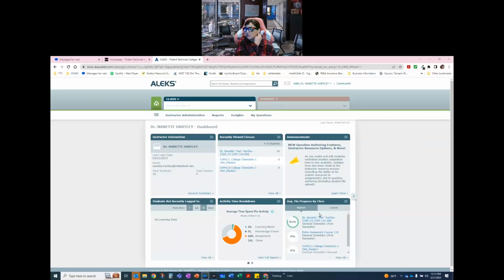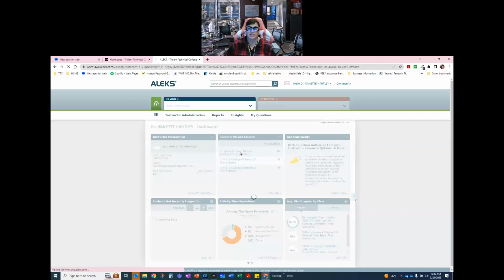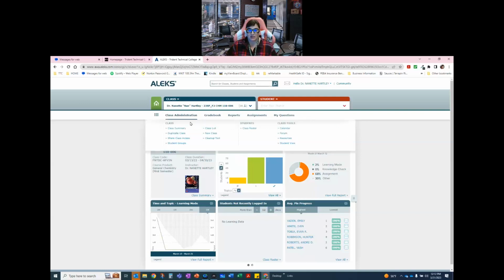The main purpose of having you do this experiment, Alex, is to show you some of the things that we would be doing if we were in a physical lab. It is not always possible for us to know exactly what the volume of a material is. Things are weird shapes, and sometimes we need a more precise measurement of what exactly that looks like. The way that we deal with that is to do the techniques that you're going to be studying in this particular experiment.